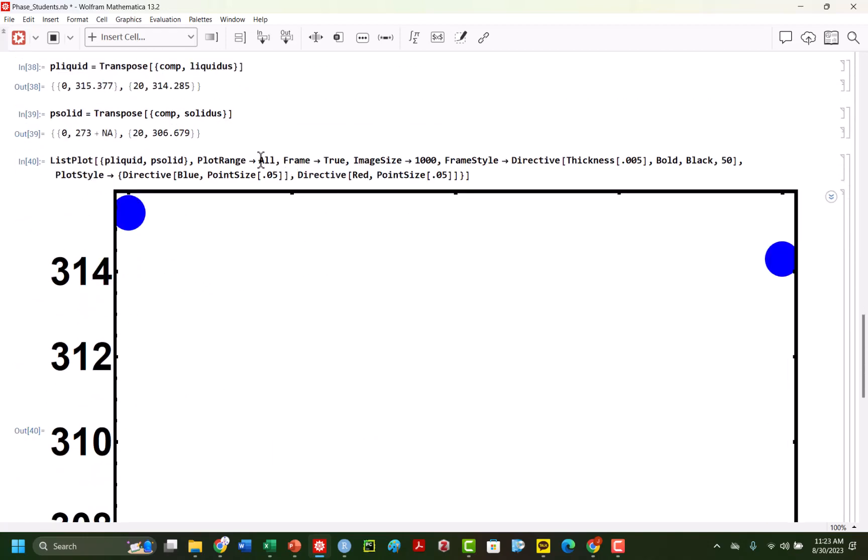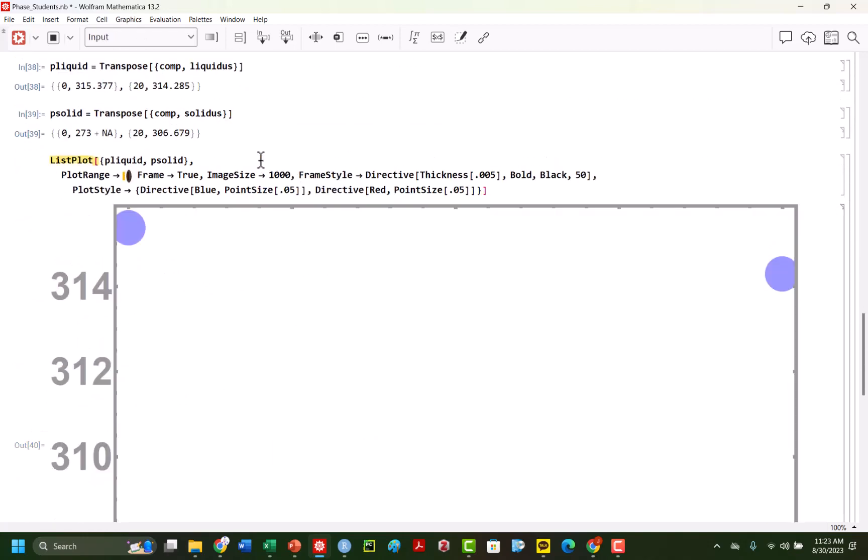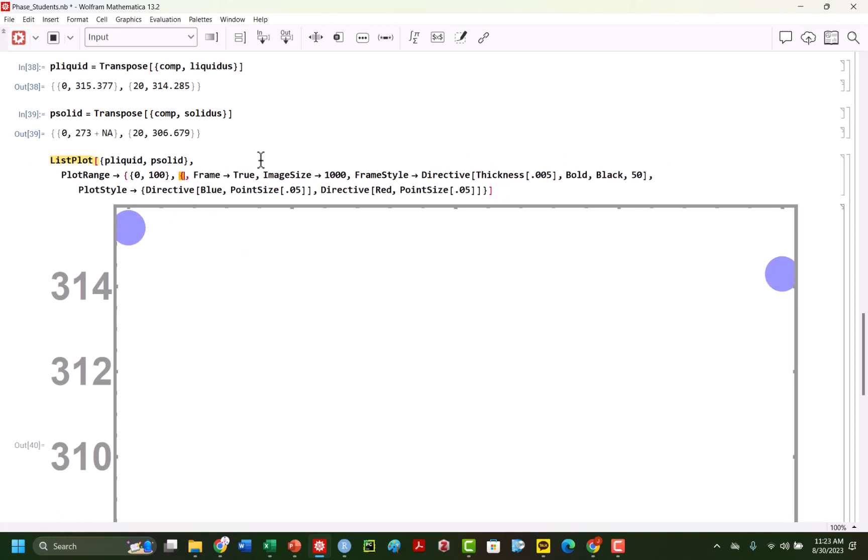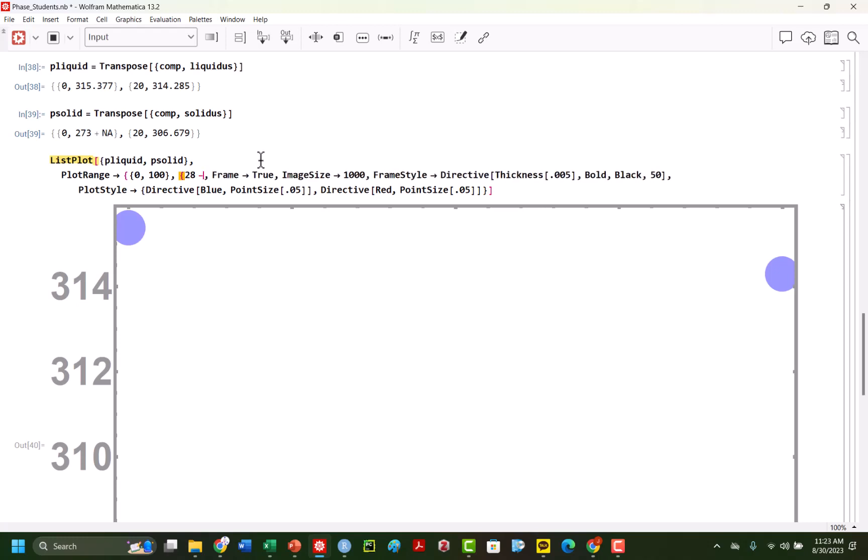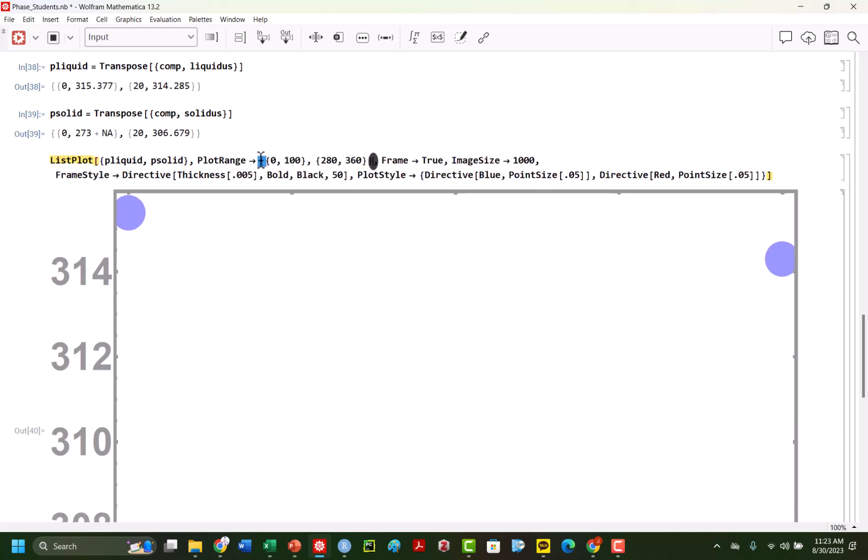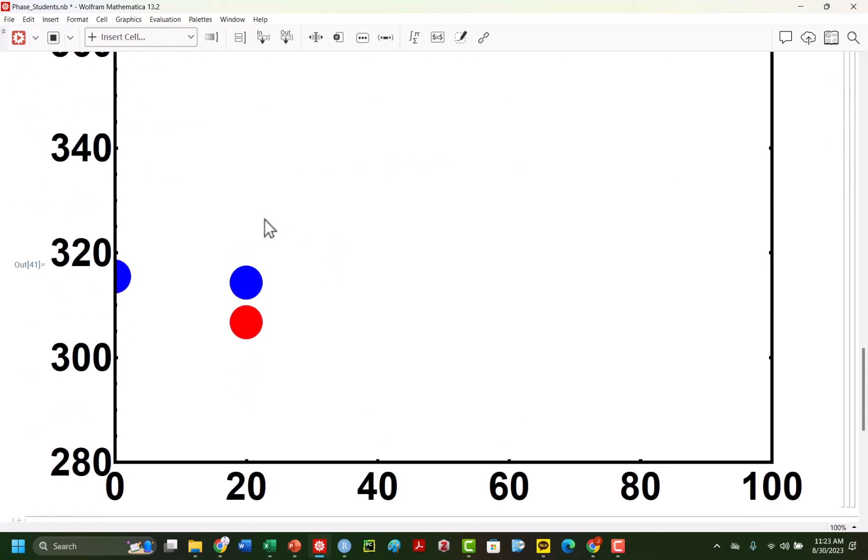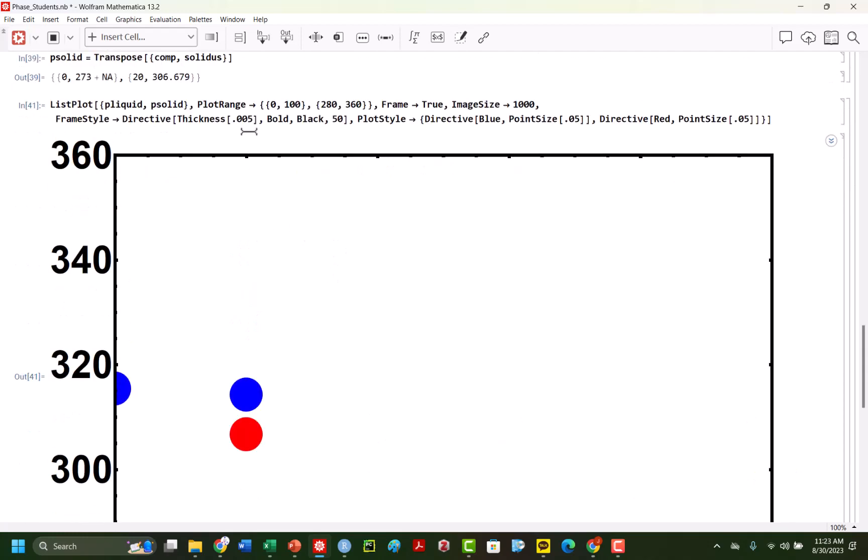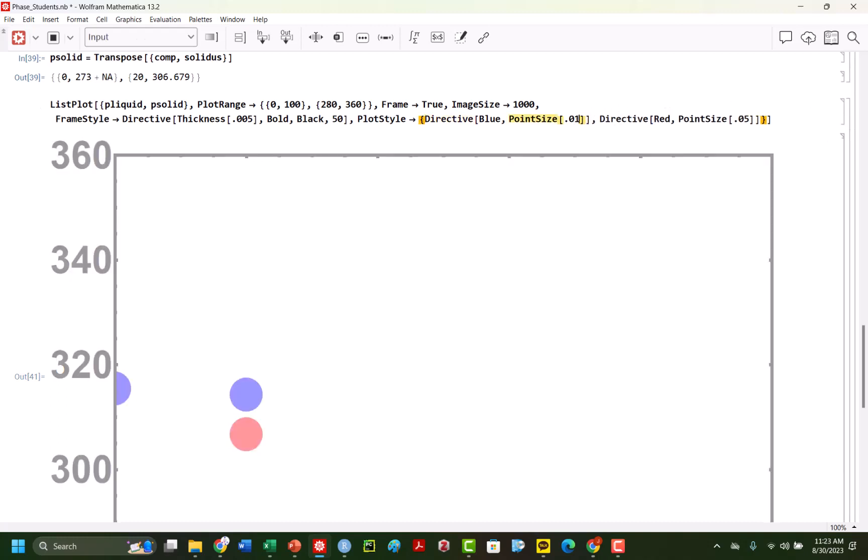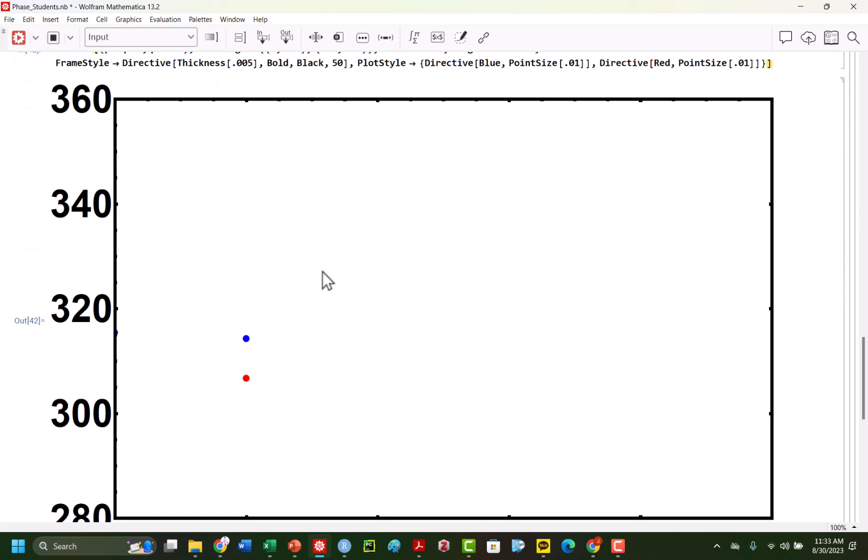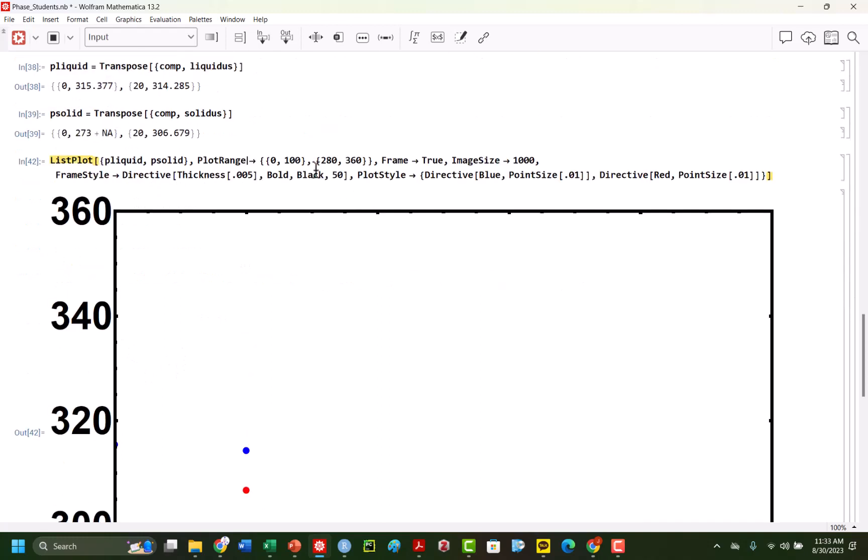So let's do plot range stuff all. Let's go from zero to 100. And then let's go from like, let's say, let's say, let's do 270. Let's do 270, and let's do 280 to 360. X and Y terms. So let's go ahead and look out here. And you can kind of see it's a little bit too big. Let's do, let's do 0.01.